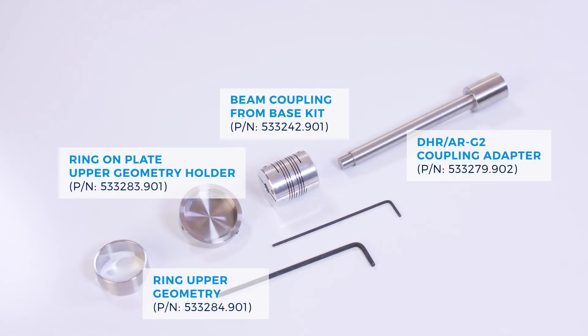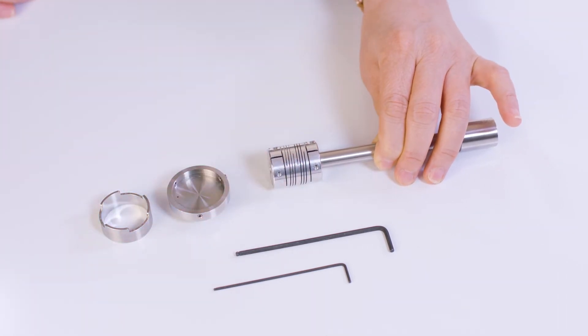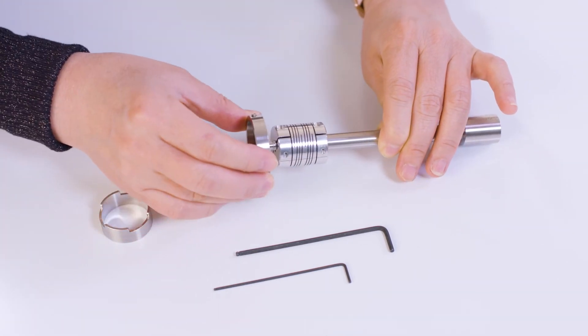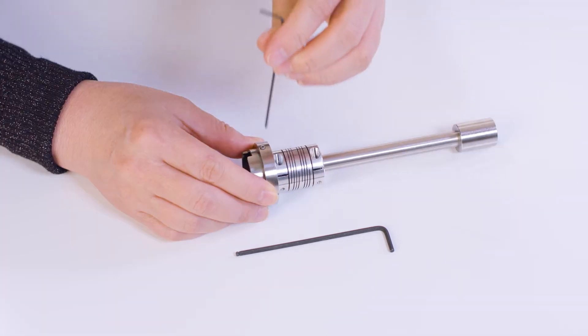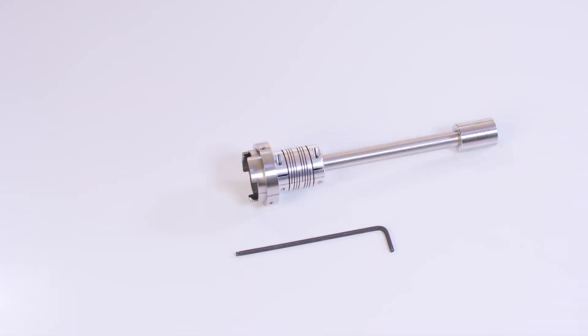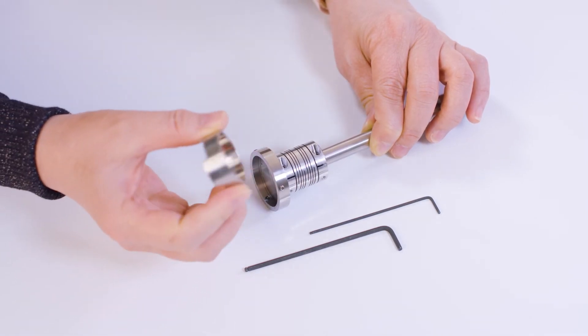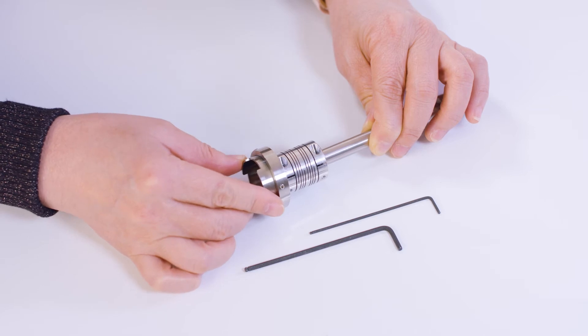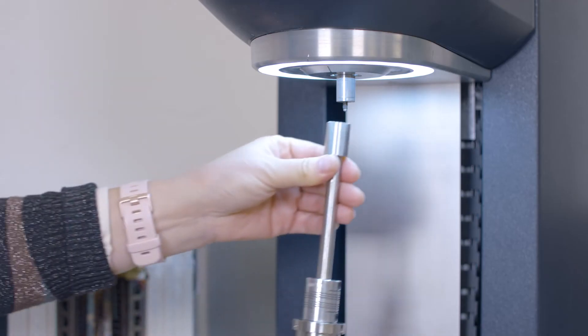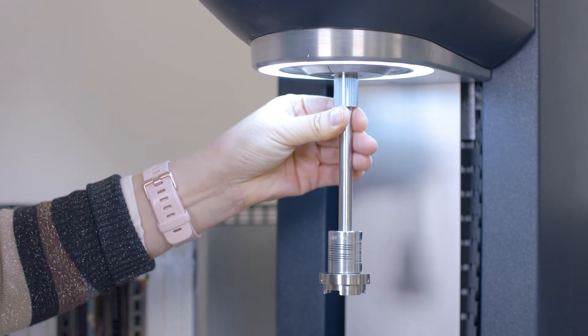For the top fixture, you will need to use this long coupling adapter. Insert the beam coupling. Attach the Ring-on Plate upper geometry holder and then attach the Ring to the holder. You can either use this side as a full ring or use this side as a half ring. After that, install this upper geometry to the top of the rheometer.